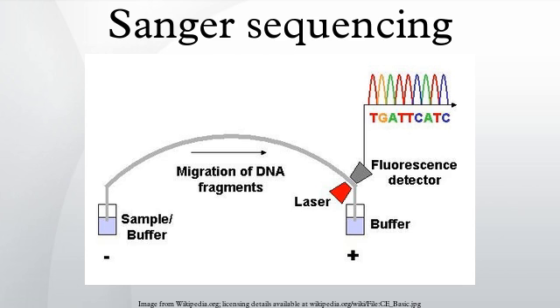Microfluidic Sanger sequencing. Microfluidic Sanger sequencing is a lab-on-a-chip application for DNA sequencing, in which the Sanger sequencing steps are integrated on a wafer-scale chip using nanoliter-scale sample volumes. This technology generates long and accurate sequence reads, while obviating many of the significant shortcomings of the conventional Sanger method by integrating and automating the Sanger sequencing steps.